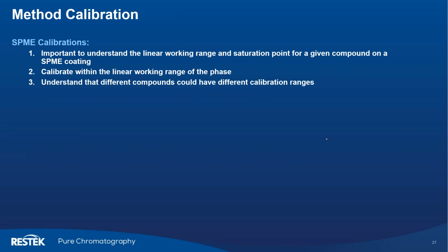Now, the other note that I'd like to make on building SPME methods is it's important to understand the calibrations and how SPME calibrations work. So SPME devices have a saturation point, right? There's a point at which no more analyte can be extracted by the device and remain on the device.